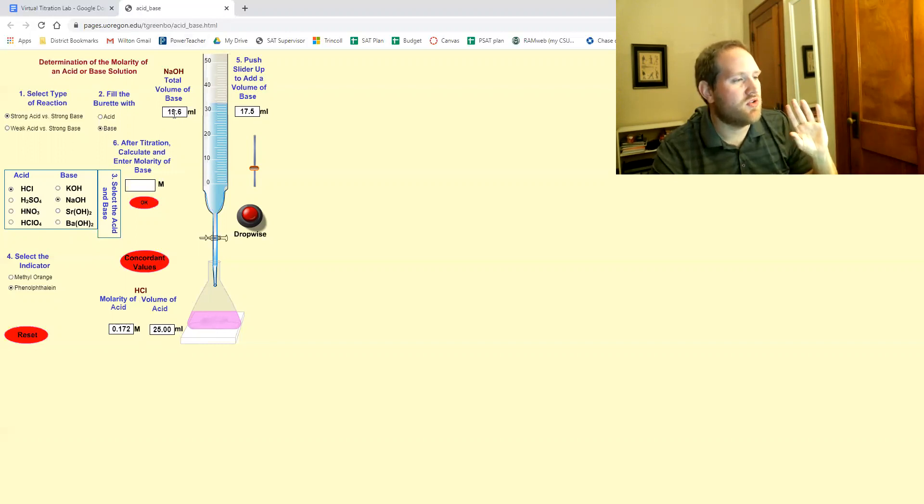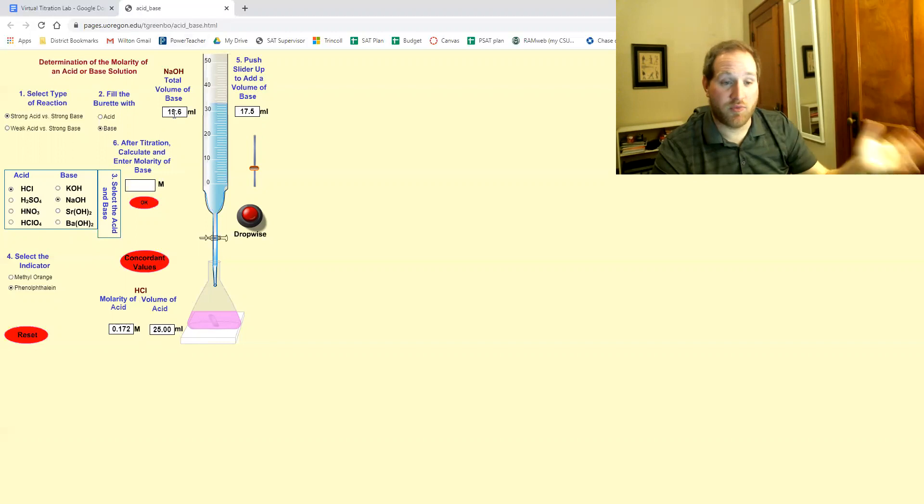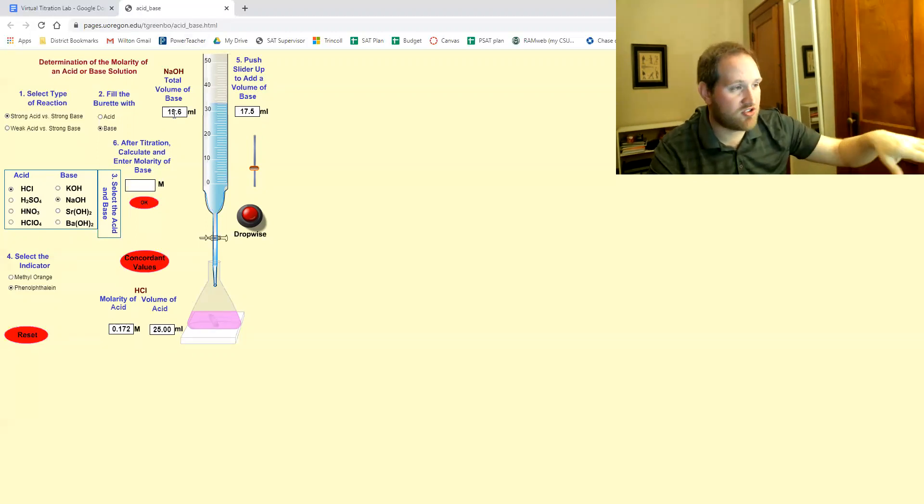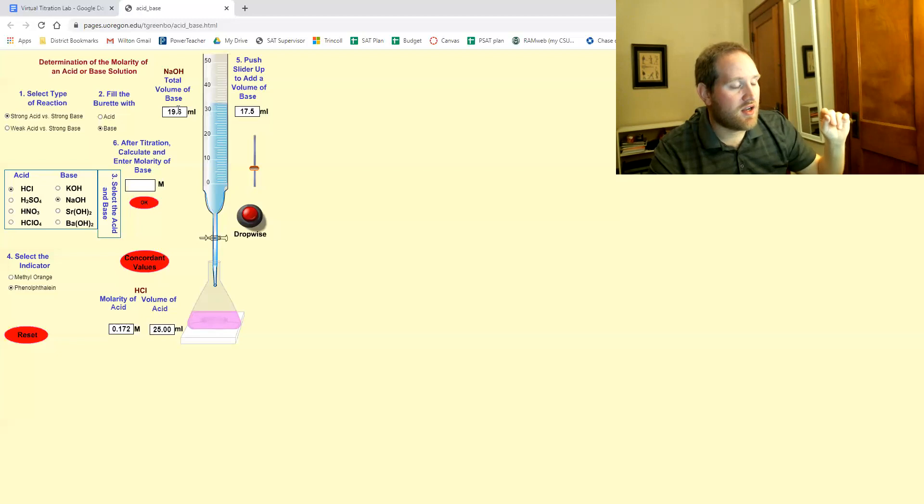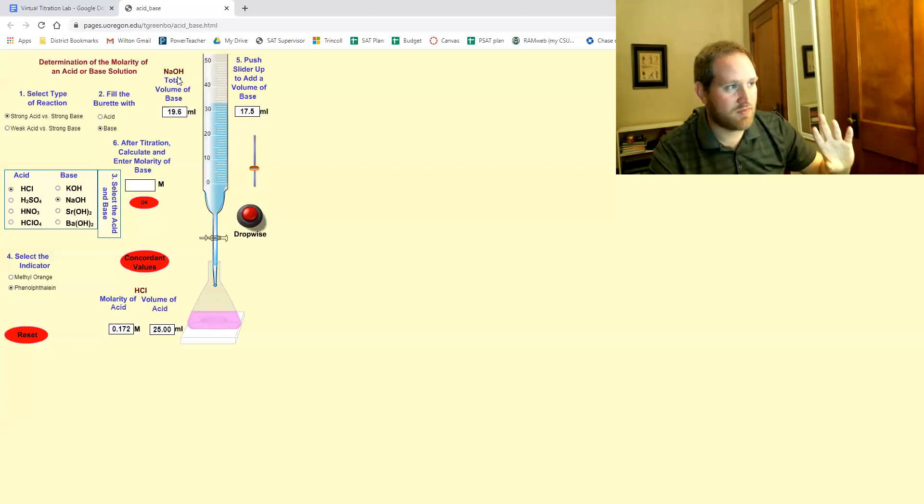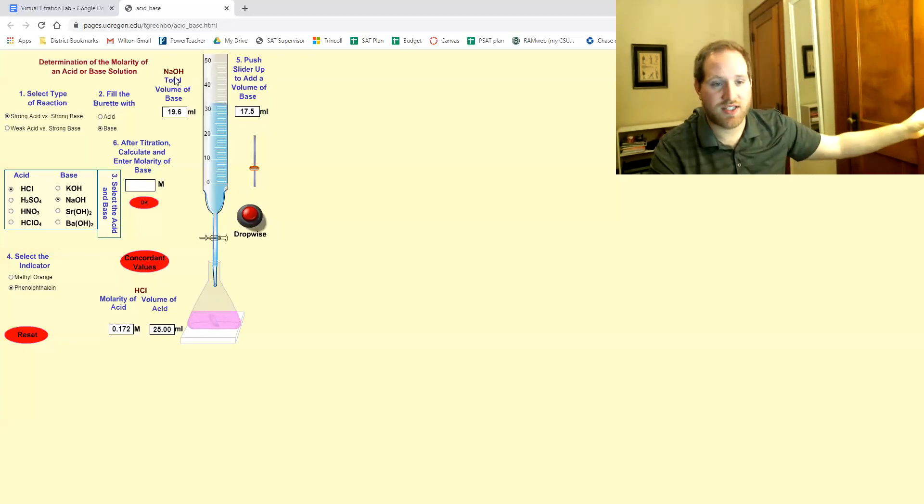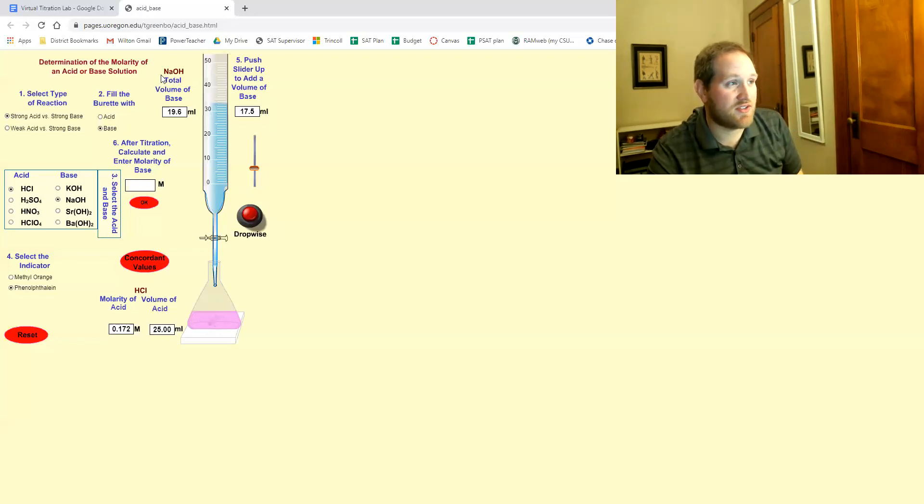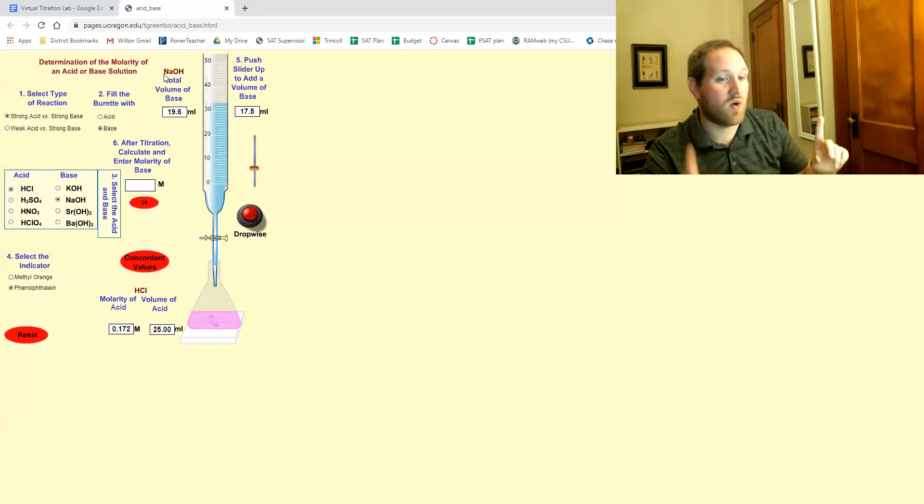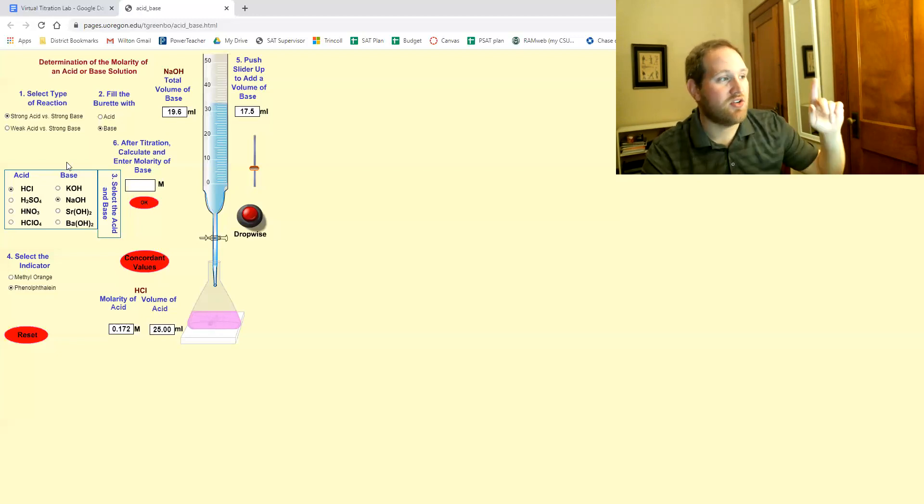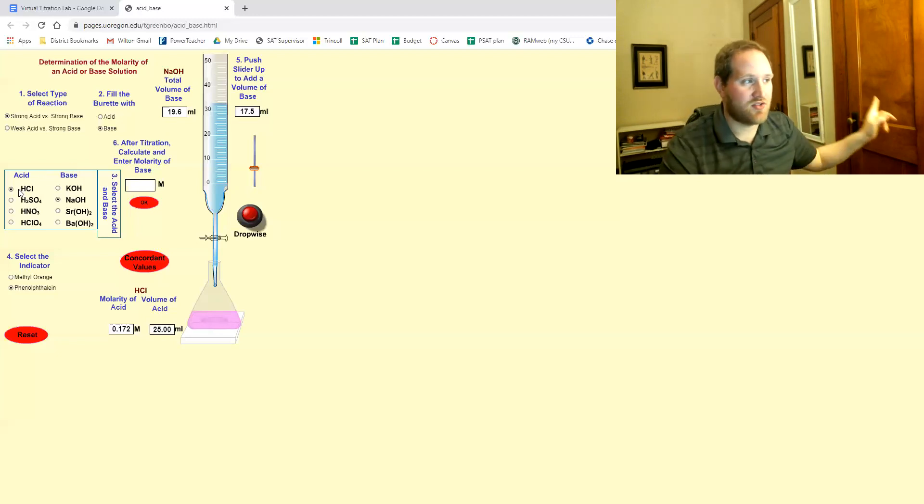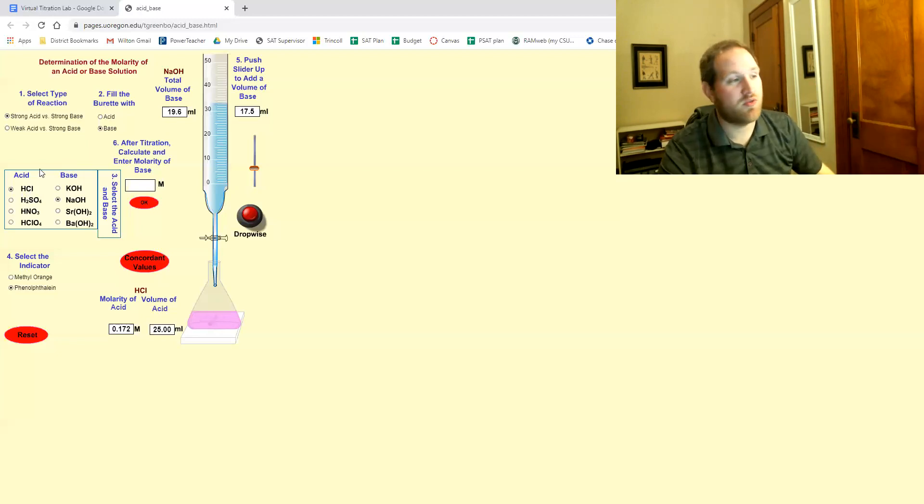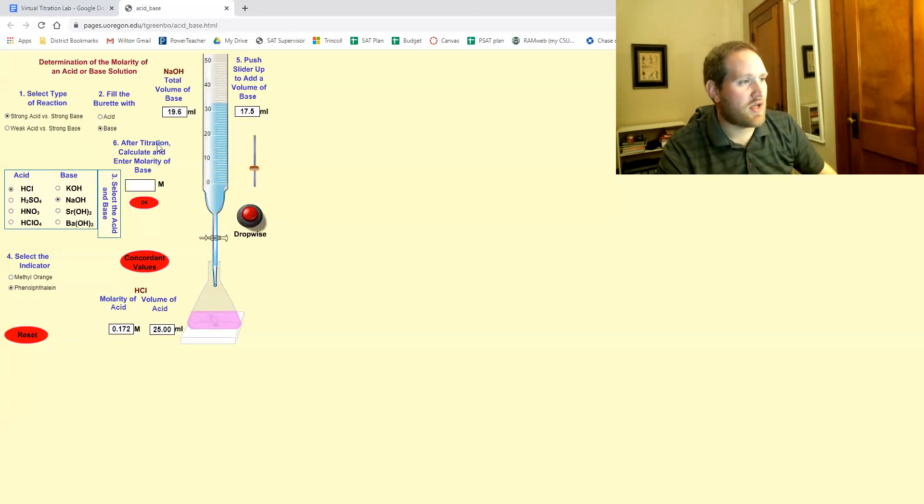So you now perform the calculations, make sure you show all your work in the calculation section of the document. If you're unsure of how to do the calculations, make sure you review the textbook or the other video. It's pretty straightforward, especially since this is a one-to-one where your base has one hydroxide, your acid has one H. You can actually use that formula I went through.